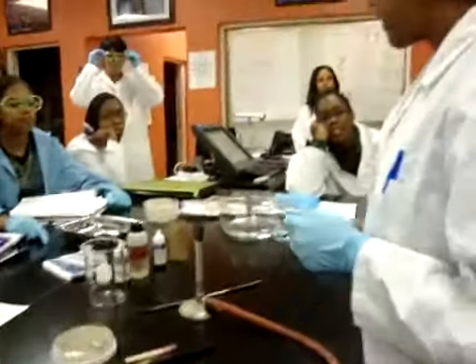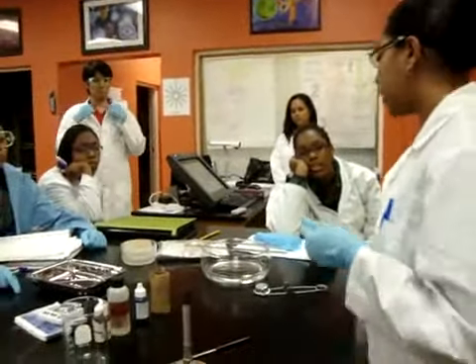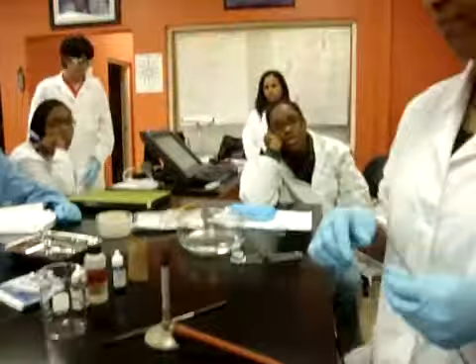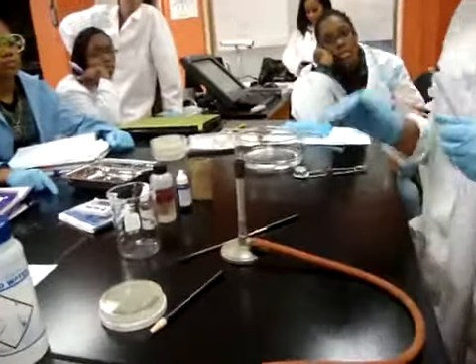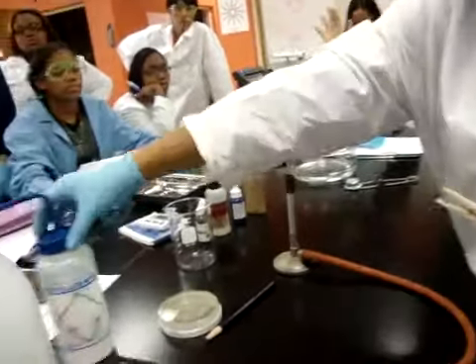Okay. First thing you have to do is prepare a smear before you can stain. Some of our equipment that we're going to use to make our smear are an inoculating loop, and your staining tray is what you're going to use to stain with. You need a microscope slide. This little clip is just to hold the slide when you have to pass it through your flame. Your striker, your Bunsen burner, and that should be about it. And a beaker of distilled water.